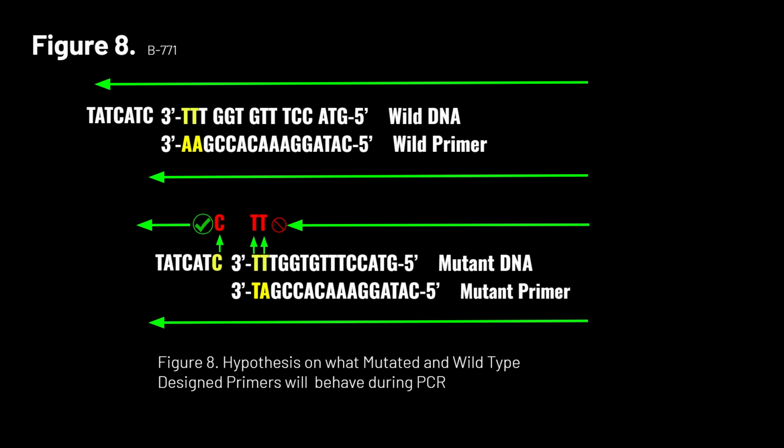For the mutated type primers in DNA, the DNA does not have bases CTT at position 508. The mutated primer was created using the Yaku-Banzhag method, and then the mutated primer will hopefully result in a band length of 473 in the gel electrophoresis results. During gel electrophoresis, we will hopefully see the 3 base pair difference with controls.